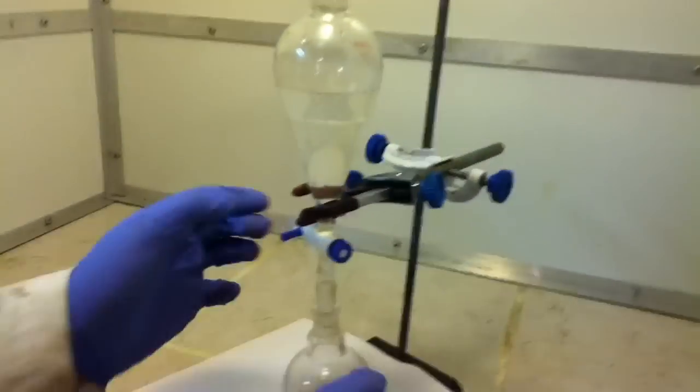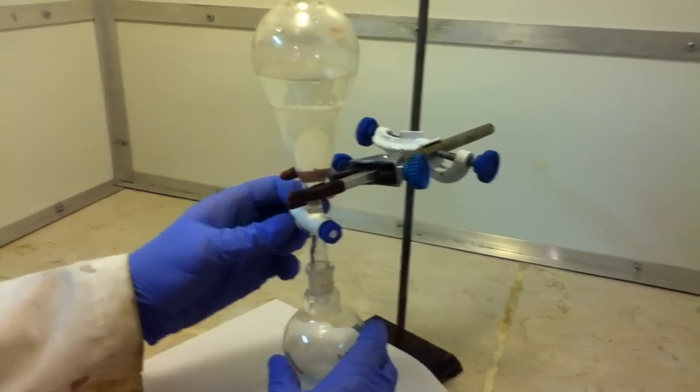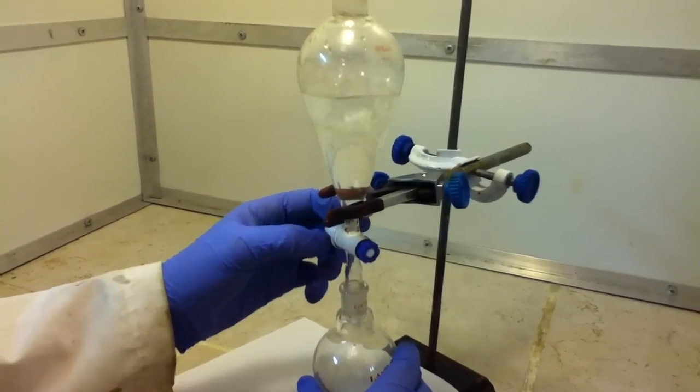Pour the remaining liquid into a separatory funnel. Then, cut off the bottom layer of the liquid. This is the chloroform.